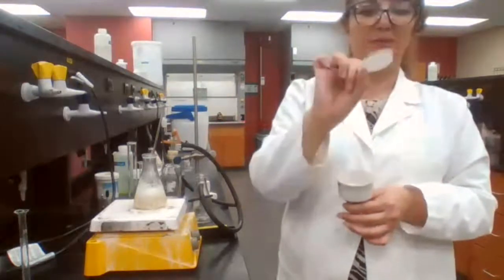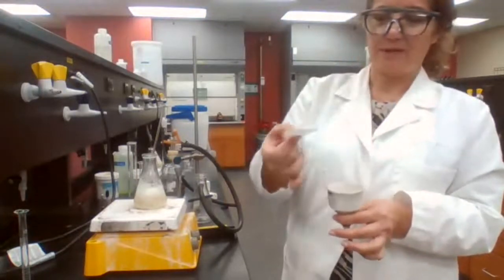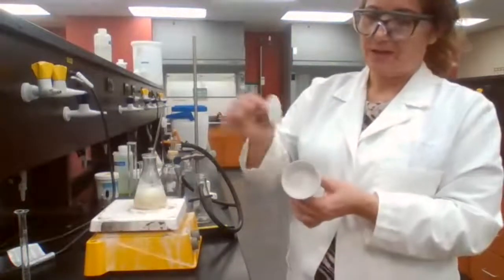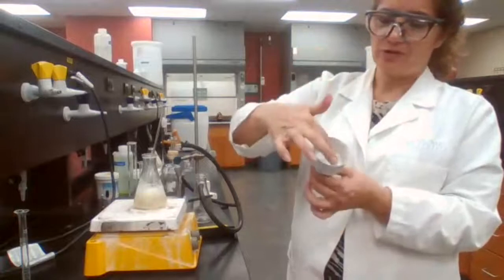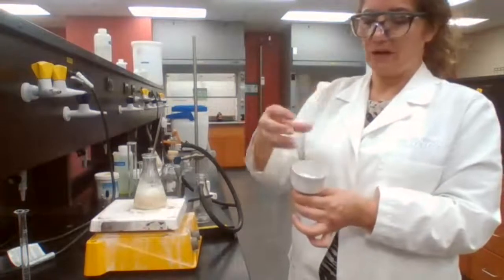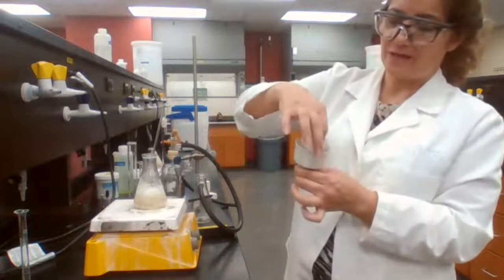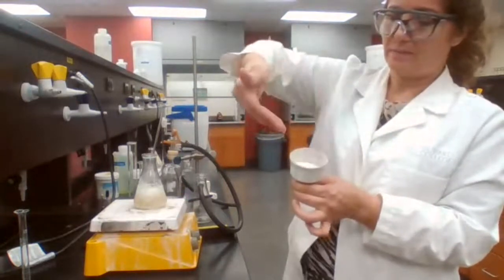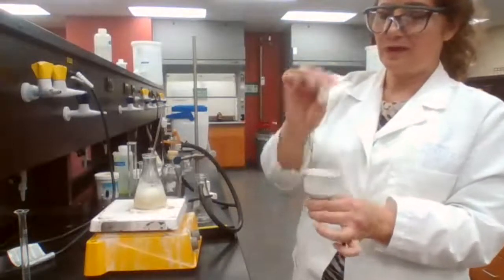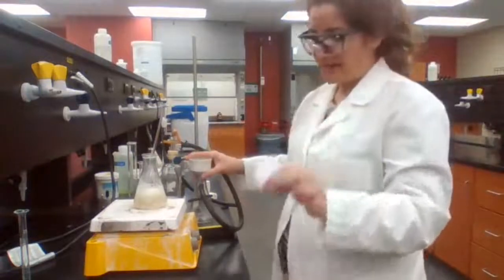If we pre-weigh the filter, then we can weigh it with the sample and get the mass of the sample at the end by subtraction. The filter paper should cover all the openings, and you can add a few drops of the solvent, in this case water, to make it stay still. If it's loose, the mixture can go underneath and you lose your sample. So before I make this paper wet, I need to measure the mass.